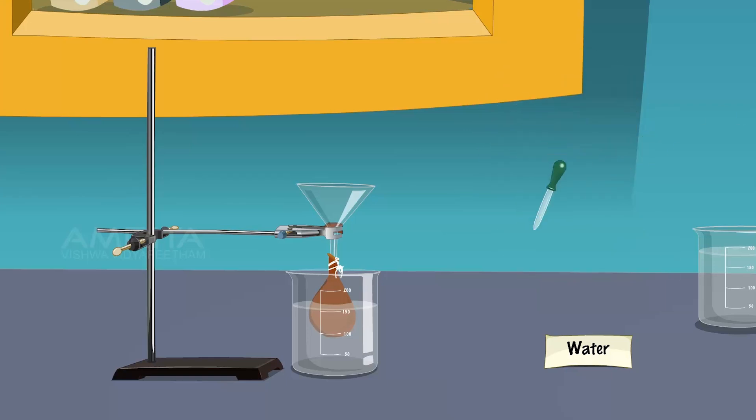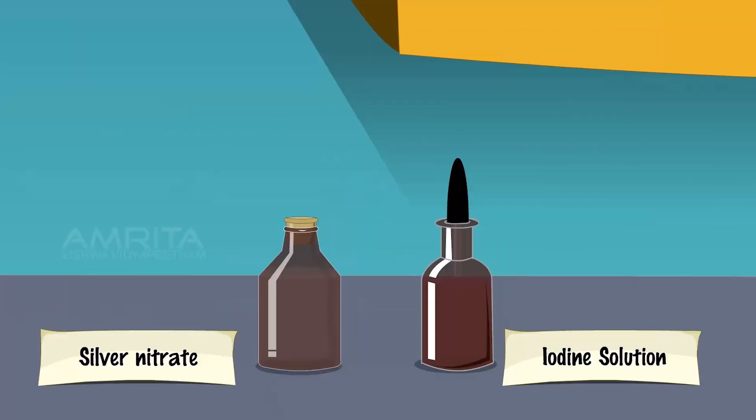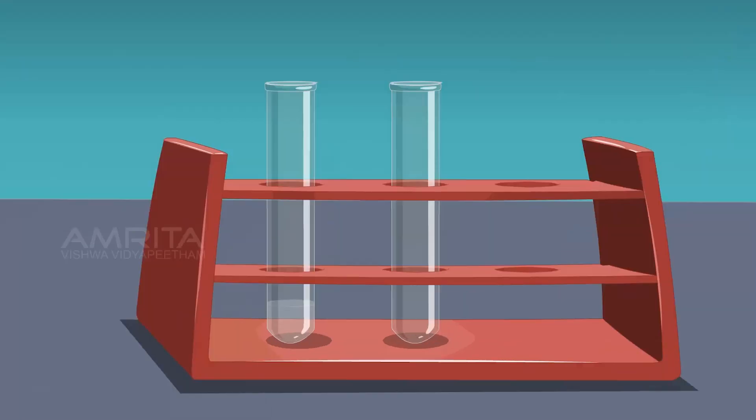After half an hour, take a small amount of water from the beaker using a dropper. Transfer it into a test tube. Take a small quantity of iodine solution using a dropper and add a few drops into the test tube containing water. If the colour does not turn blue, it depicts the absence of starch in water. Thus it follows that starch molecules do not diffuse through the parchment membrane.